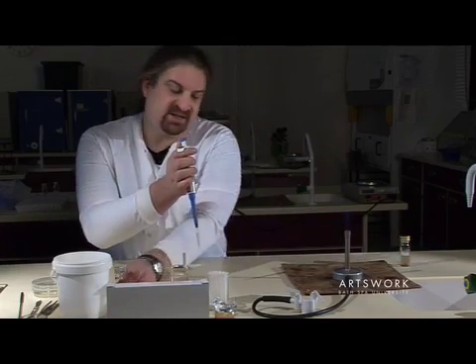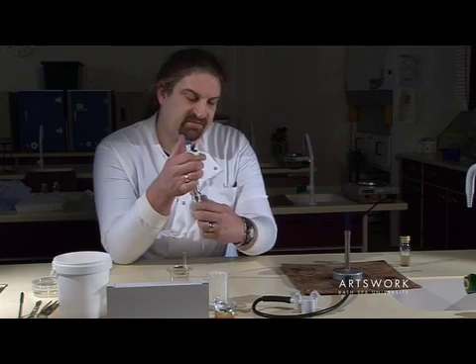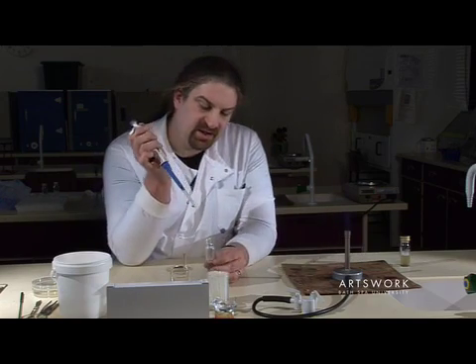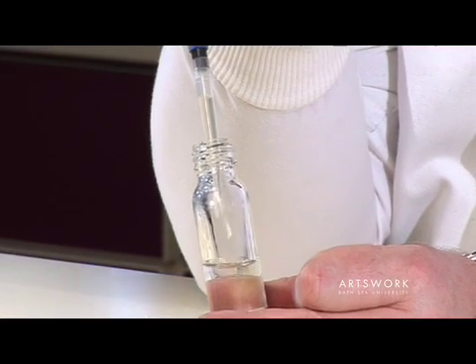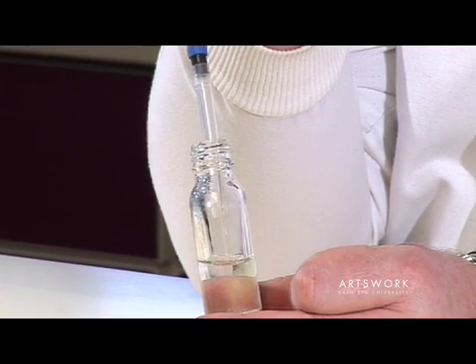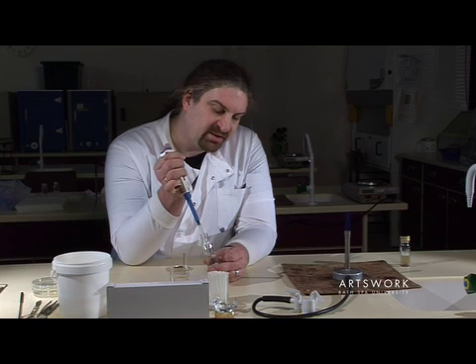To dispense that sample, open up your sample container, flame it, and place the tip into the bottle — this time you do not need to place it into the liquid. Depress the plunger to the first stop and then all the way to the end to get rid of every single drop of your sample.